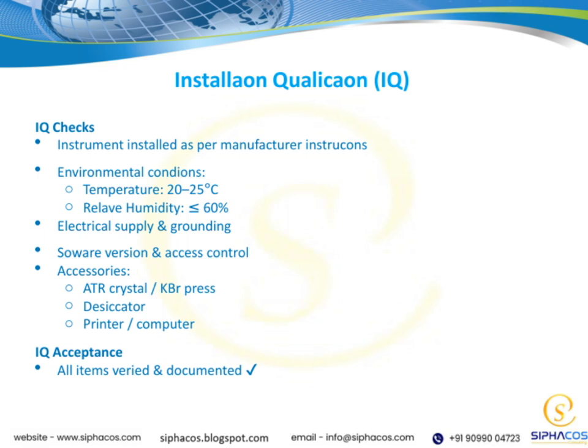In summary, the IQ process helps us confirm that the installation is correct, the environment is suitable, and all components are accounted for, setting the stage for consistent, reliable results in our analysis.